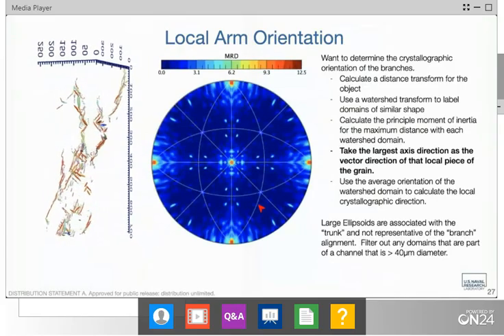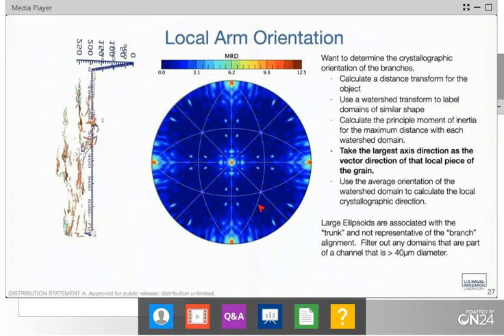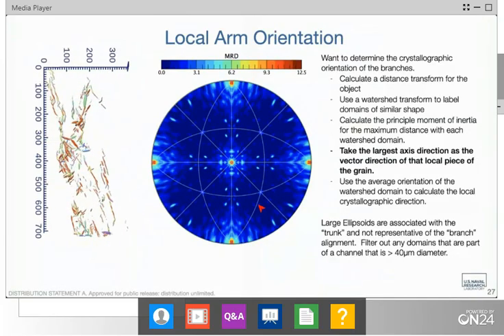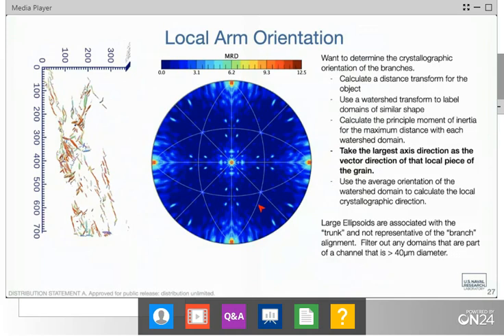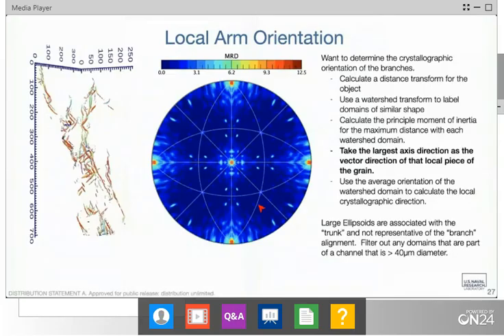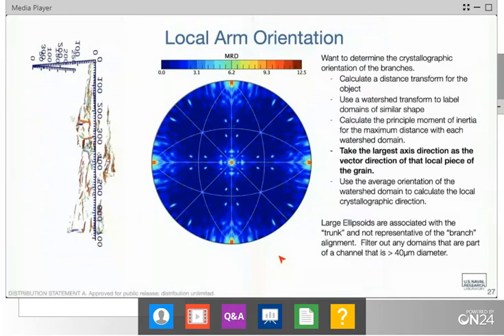I'm just plotting this as essentially an inverse pole plot. And you can see that the vast majority of these grains all line up along 0, 0, 1. These are the fast growth directions within additive manufacturing. It's not surprising, but it is kind of surprising to what degree it's dominating the morphology of these grains as they grow from layer to layer.